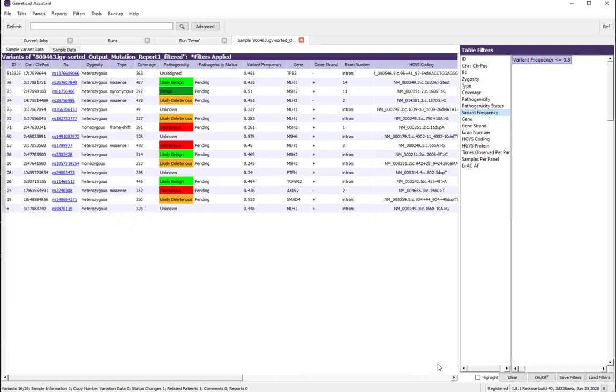When adding additional fields for filtering, you can combine the fields on an AND or OR basis. To add the next field as an AND filter, requiring both filters are met, drag and drop the second field so that your cursor is directly on top of the existing filter. To add the next field as an OR filter, so that either one of the filters can be met, drag and drop the second field anywhere else on the right side of the filter pane.